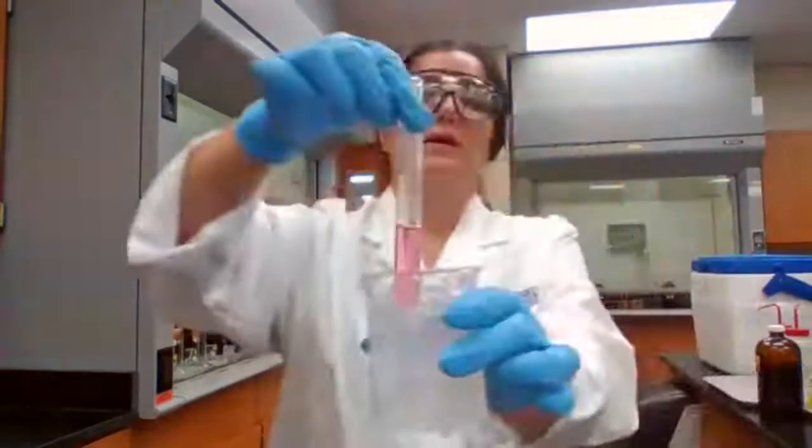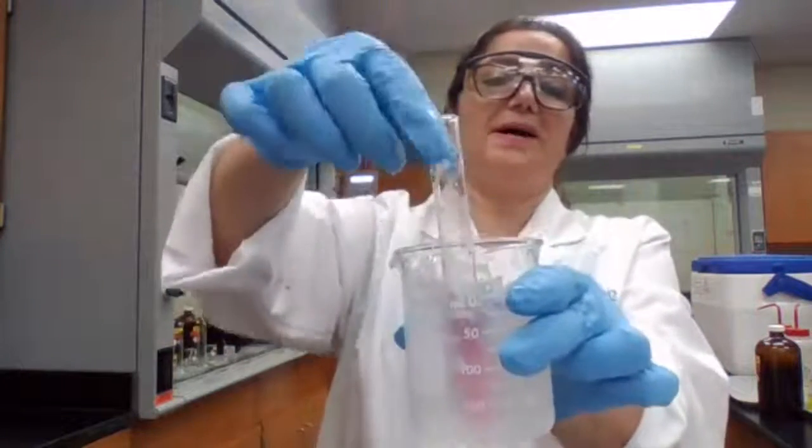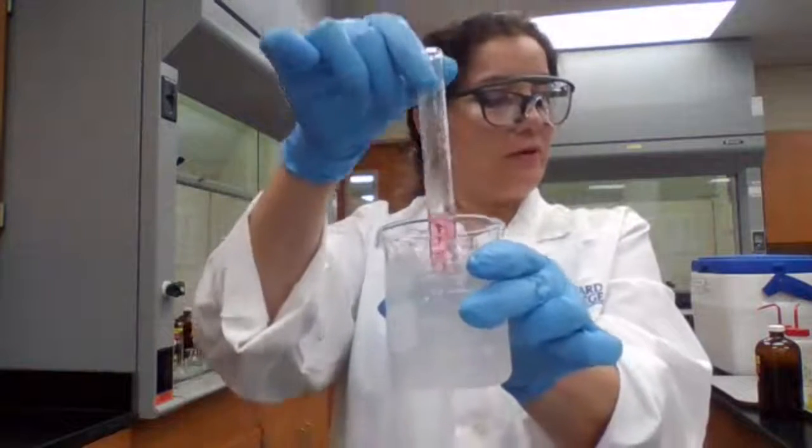Going to let it stay for you to record the observation. Record your observation in the ice bath. This is filled with cobalt, and see what happens in cobalt.